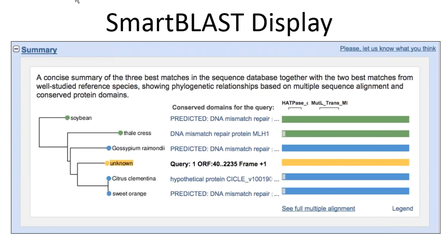This is the heart of the SmartBLAST display. This is a search I did with a translation of an open reading frame from the lychee nut transcriptome. I can quickly find a name for this novel protein sequence — it's probably a DNA mismatch repair protein. The name comes from the green matches, which are the reference or landmark genomes; Arabidopsis would be the one to grab the name from. This is the MLH1 homolog in this plant.